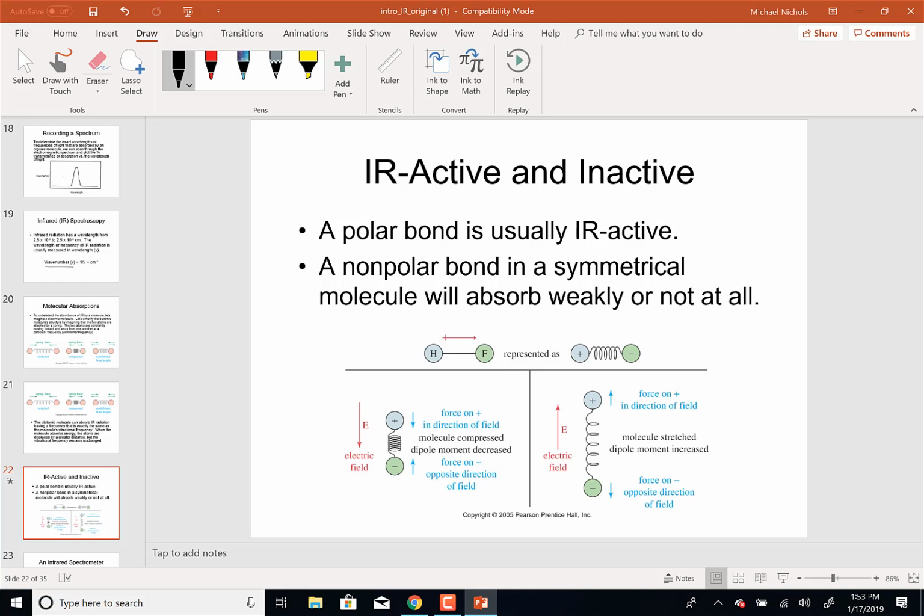And so that's how they get that measurement of, I think we're up to 300 and some parts per million. Those of you that had Dr. Johansson's class last semester. So that's how they make that measurement, because CO2 will actually absorb.